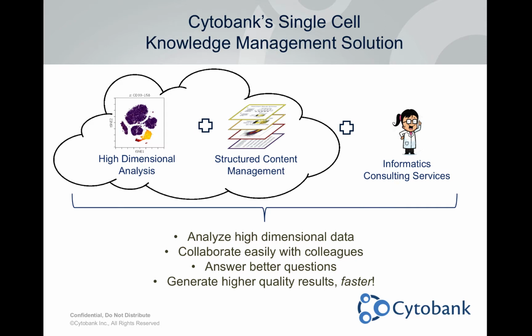And in addition to that, in our software, we have the structured content management. And these are tools, like I said, to archive or to collaborate with other scientists. And those comprise our software offering. But in addition to that, we have our informatics consulting services, which Dr. Kat Drake is essentially in charge of. And these are where we do bespoke analysis using tools inside and outside of Cytobank for customers on existing data sets. So I won't talk much more about this. Again, this is a presentation focused mostly on Citrus, but you will hear this mentioned one or two more times.